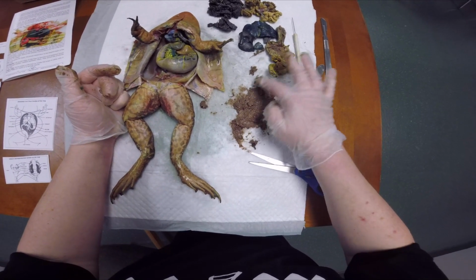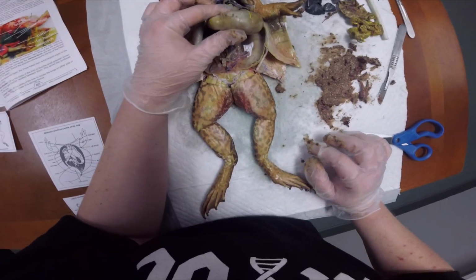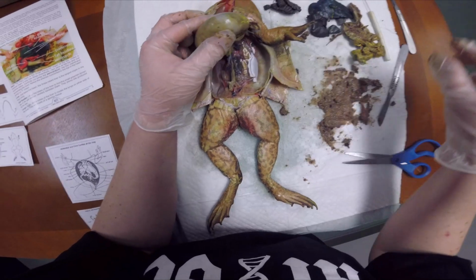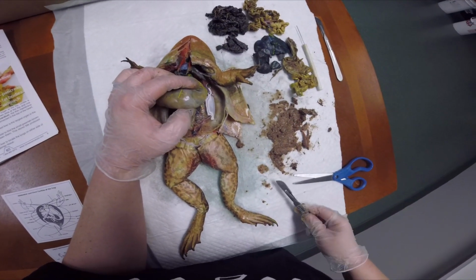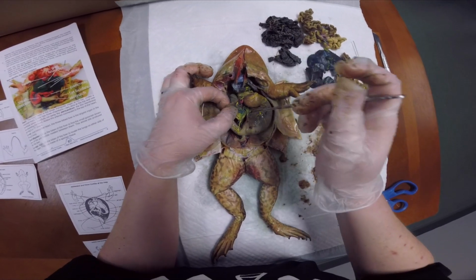Looks like, let's see what's in the stomach. As you can see, this one has a huge stomach, and they don't normally have enlarged stomachs like this. So I'm interested to see.